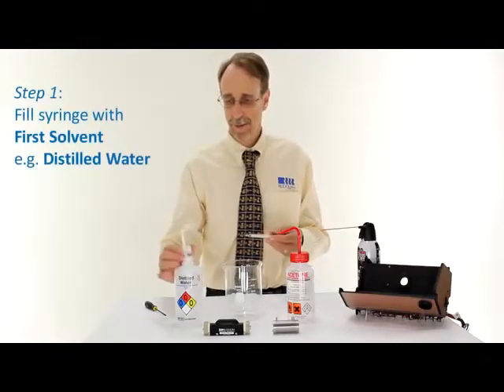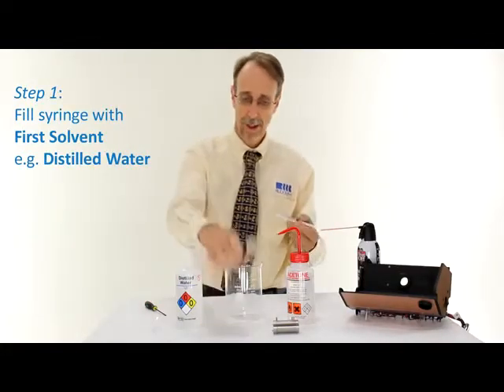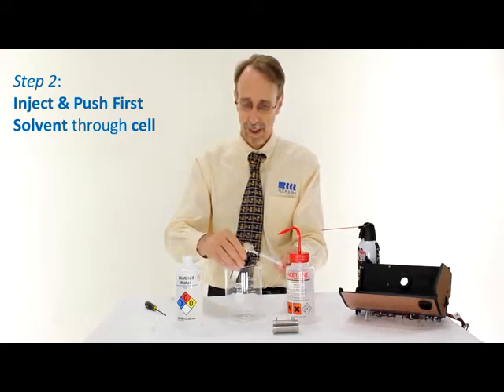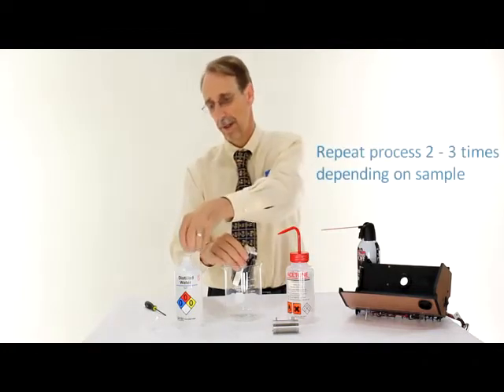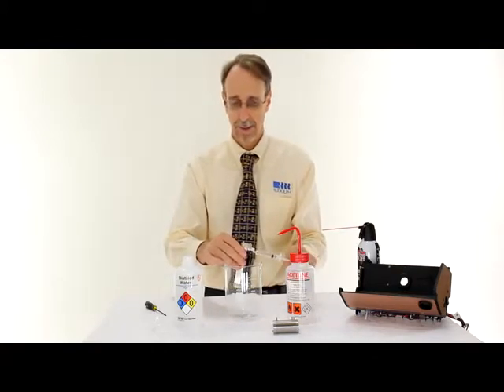First, I'll fill the syringe with the first solvent, then inject this into the cell. I'm pushing the solvent through to wash out any traces of the sample — back and forward perhaps, just to create a little cleaning action, and out it comes. You may wish to do this two or three times, depending on how sticky the sample is.